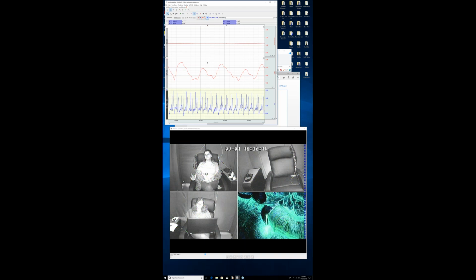Using the video and the LED would be my recommendation, and trying to set that up at the beginning so the LED is within view, even if it's just temporarily held in view. And then once you've captured it at the beginning, you can take the LED out and let the system run for long periods of time.